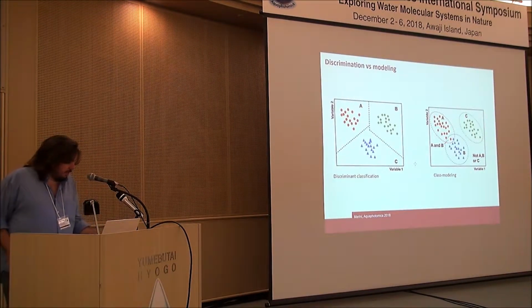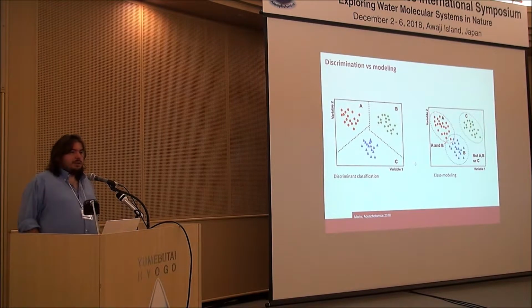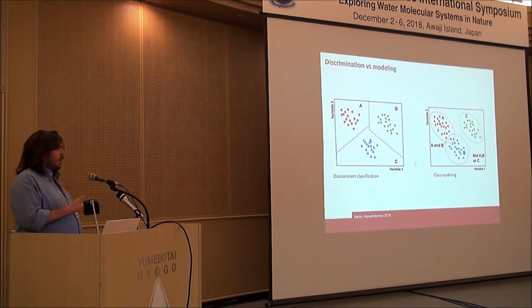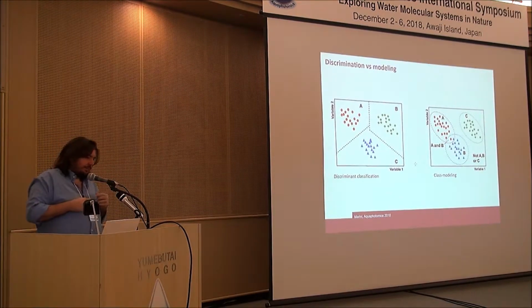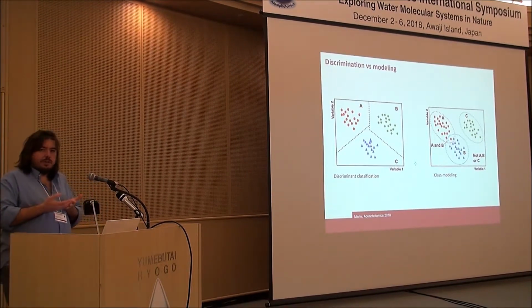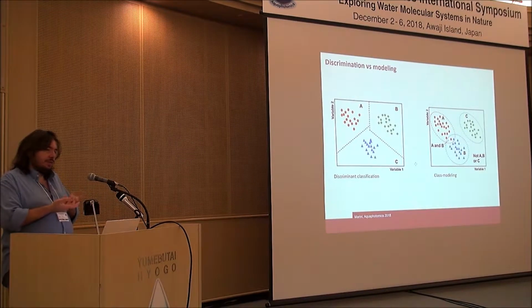Some few words, just a few, on the possibilities of predicting qualitative variables. So sometimes we want to correlate the experimental results to a variable that is qualitative in nature. So it's not quantitative, it is qualitative, it is discrete.